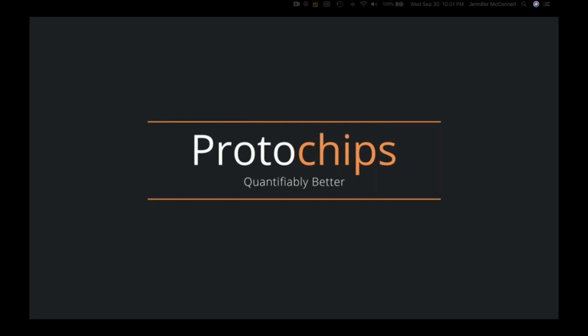I'm David Nakashi, and I'm here with Jen McConnell, our product manager. As many of you probably already know, AXON is our new powerful machine vision platform. It analyzes a stream of live STEM or TEM images, and by controlling the TEM, it compensates for movements in the X, Y, and focus, all while loading the images with metadata from the TEM, camera, and in situ systems.